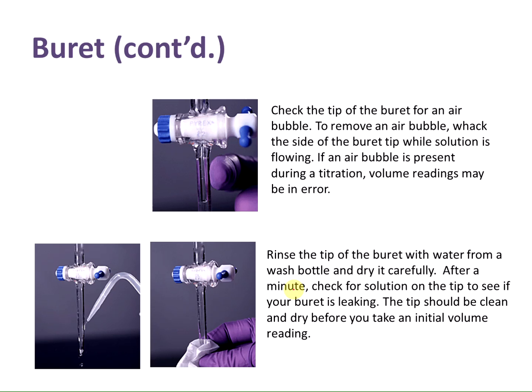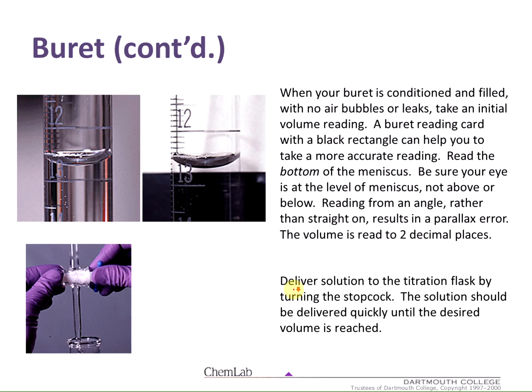Also, rinse the tip of the burette with water from a wash bottle and dry it carefully. After a minute, check for solution on the tip to see if your burette is leaking. The tip should be clean and dry before you take an initial volume reading.